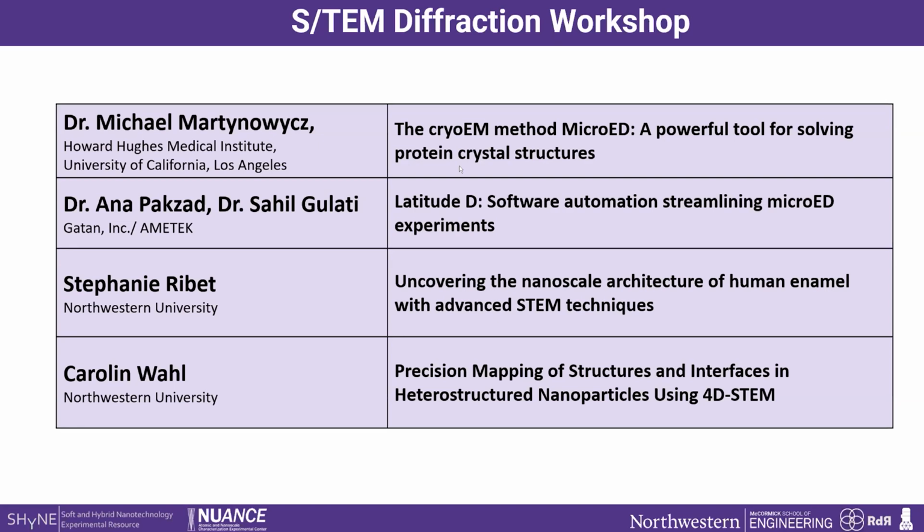So that also having detectors that can collect diffraction patterns when you operate the microscope at acceleration voltages that are lower than the typical ones, say like 60, 40 kV, like 40 to 60 range. That is not typical. That helps you on that. Of course, there's some limitations about the sample, but that's another issue, right?